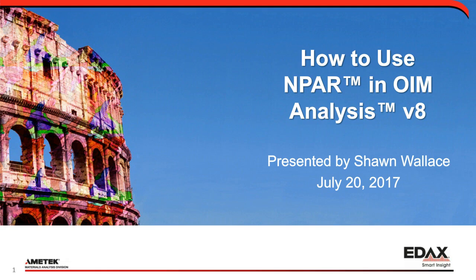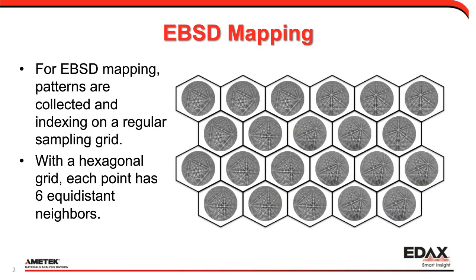NPAR has literally changed everything I do, from data collection to data processing. So I think it's very important for you as our users to understand how we use it and to go from there. To start off, we'll talk a little bit about the basics of EBSD mapping.